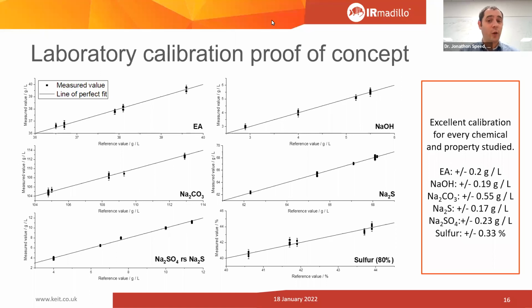And if it's a scale that we've seen before, we can actually flag that up as, I am now scaled, you need to take me out and clean me. This has happened once in a year for that spectrometer, so it's not a frequent event, but it is something that we need to be aware of.